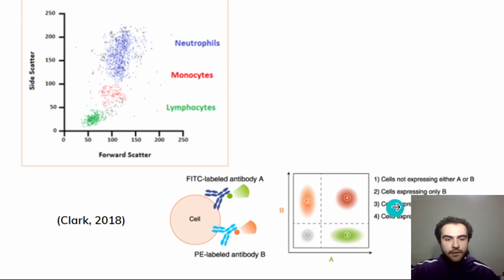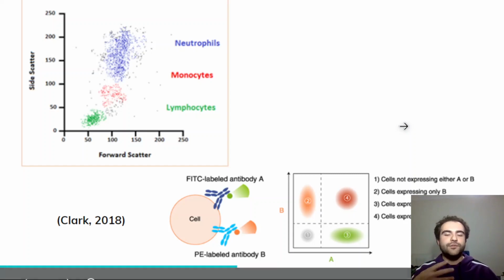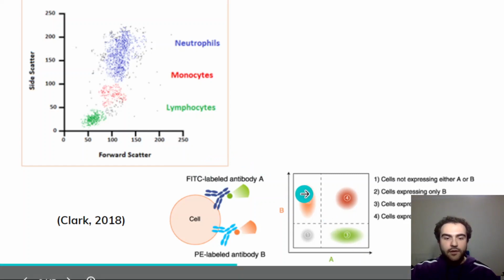And here it shows what happens when we use two different colors to indicate the cells. If they are in different areas they look like these two colors, I mean orange and green, but if they are together it becomes darker.